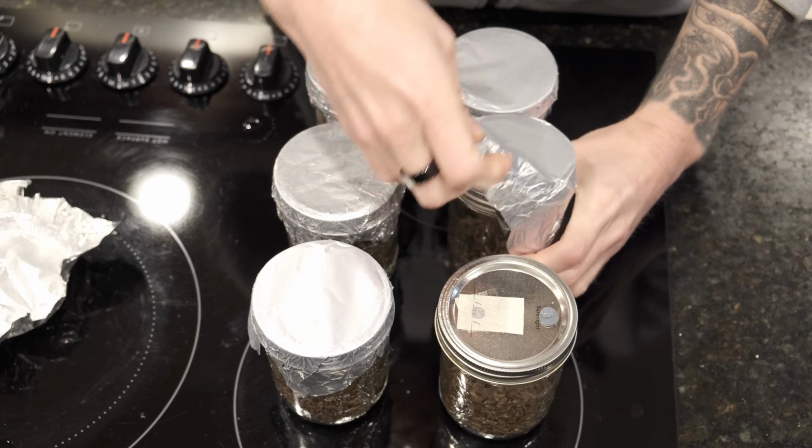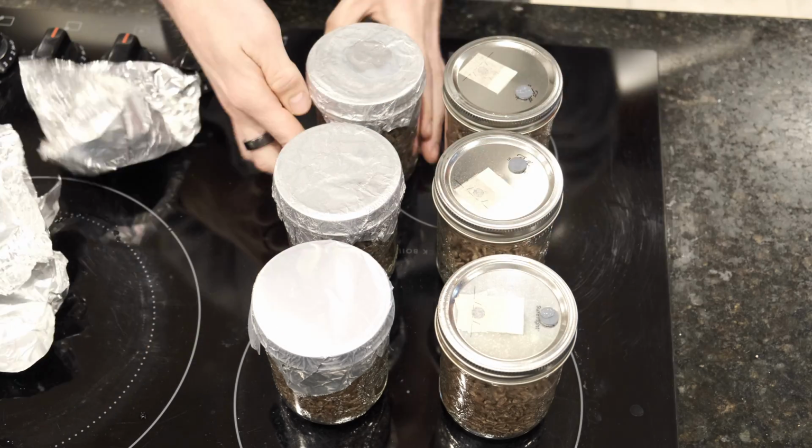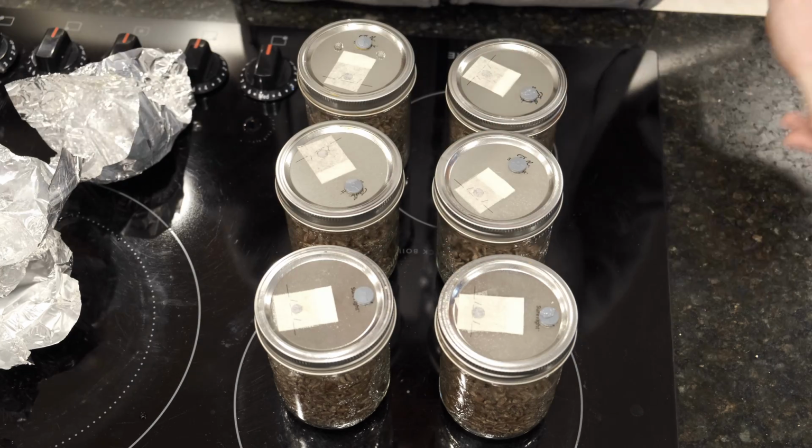From here you can inoculate your grain with a grain-to-grain transfer, liquid culture, or spores. And we can easily save and reuse this tinfoil later.